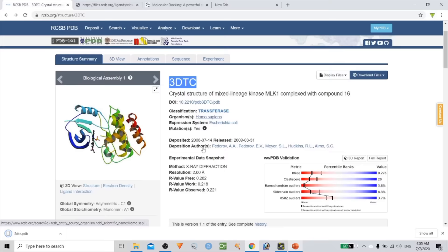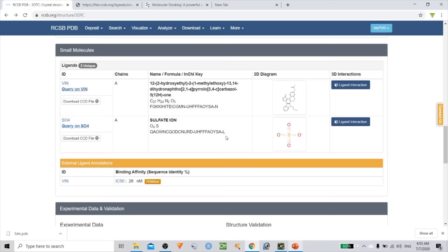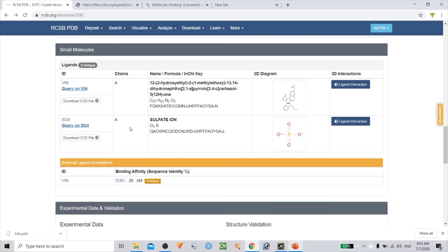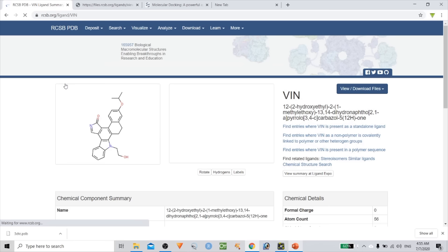Create a folder and save the downloaded file. Scrolling down, you can see that chain A is the protein molecule; it also contains an inhibitor VIN and a sulfate ion.